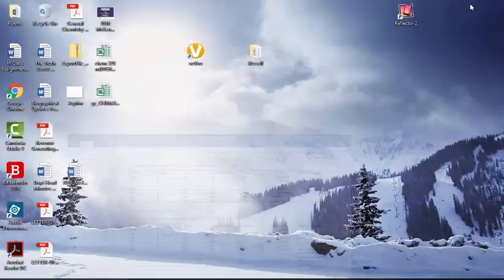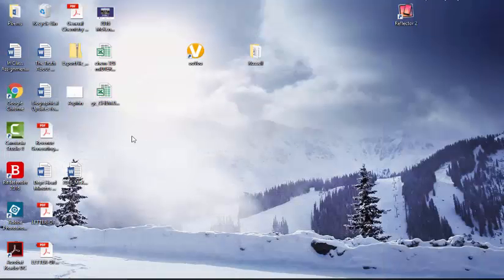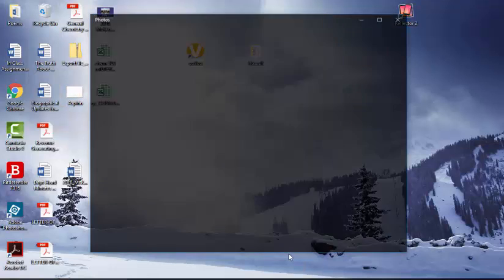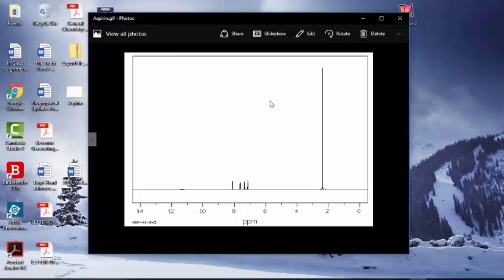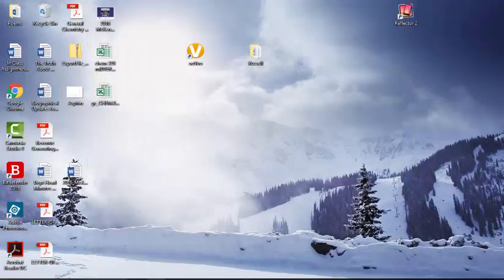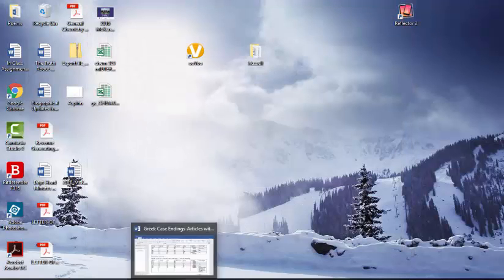And if you go back to your desktop and find it, you'll see that it opens here. So this is the H1 or the proton NMR for aspirin.